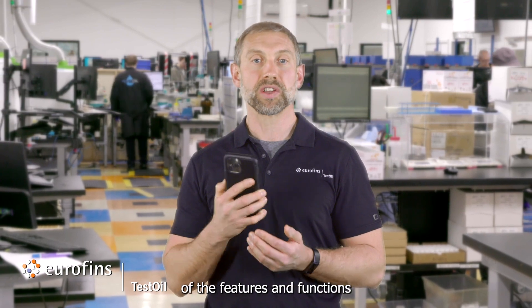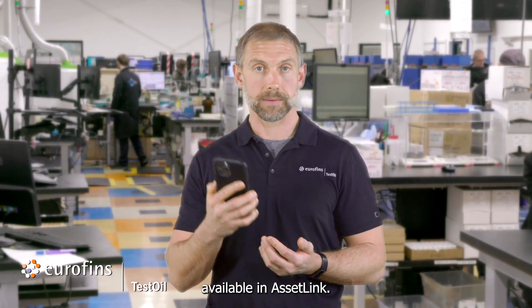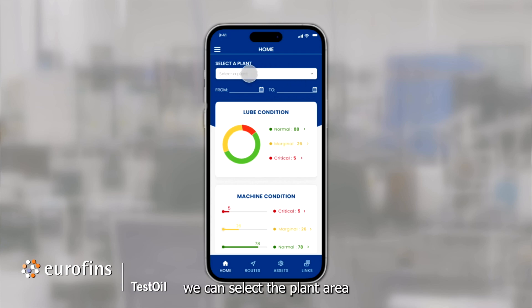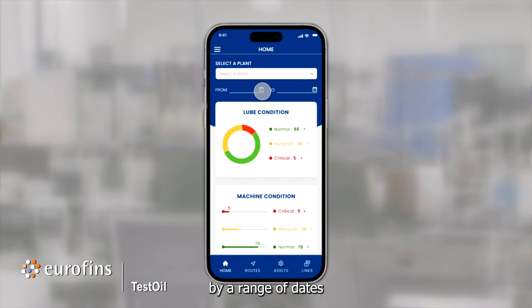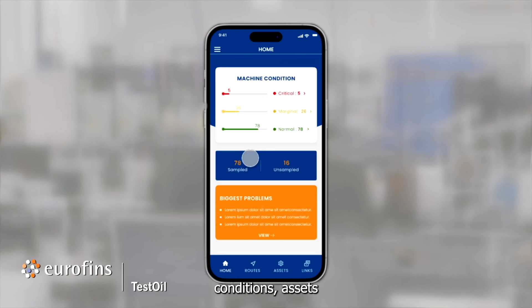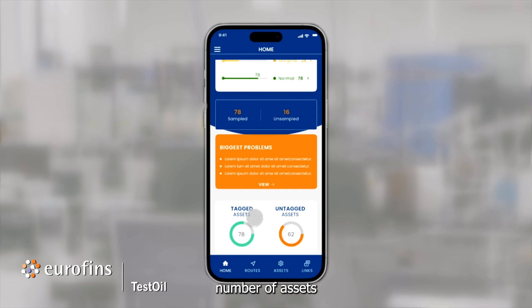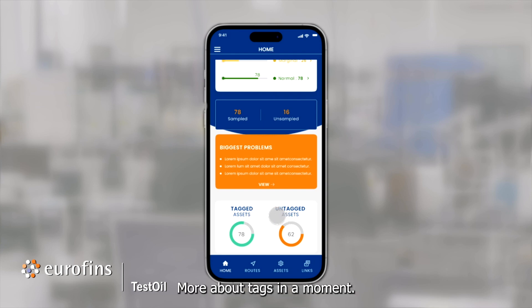Here's a summary of the features and functions available in AssetLink. AssetLink's landing page is a program dashboard. From here, we can select the plant area or machine grouping, filter by a range of dates, and see summaries of the lubricant conditions and machine conditions, assets that have been sampled versus those that have not been sampled, a summary of the anomalies or problems discovered in testing, as well as the number of assets that have been tagged and untagged. More about tags in a moment.